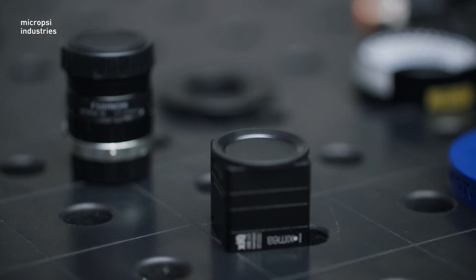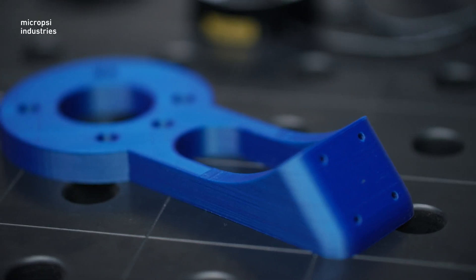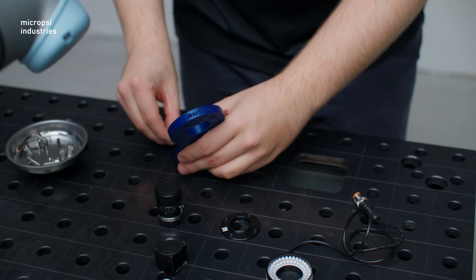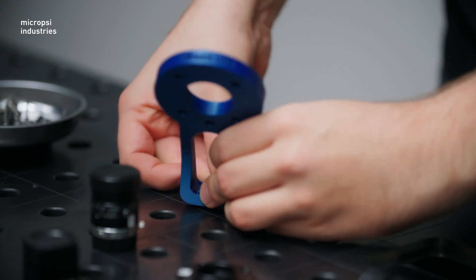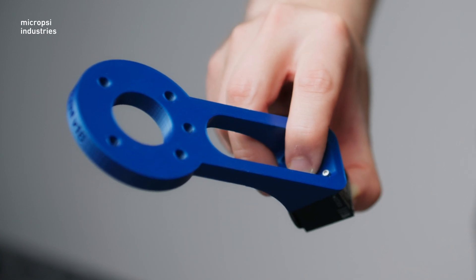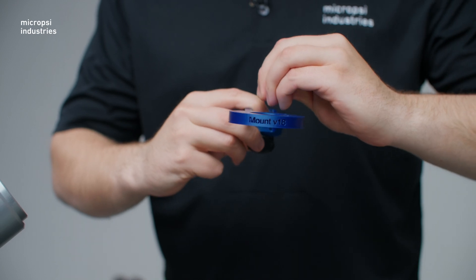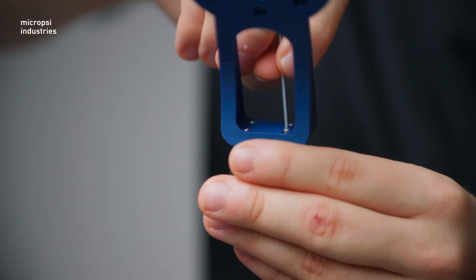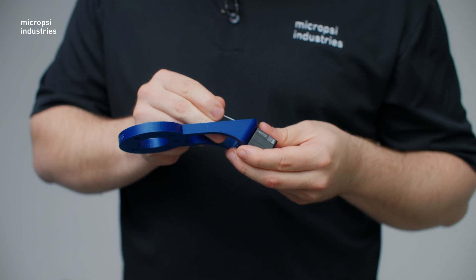We start with the camera, which will function as the robot's eyes. We need to attach the camera to the camera mount. We put the screws through the holes on the mount, and using a screwdriver, fix them to the camera. Make sure the orientation is right. When you position this Ximea camera on the mount, the plug for the cable should be on the side of the mount.